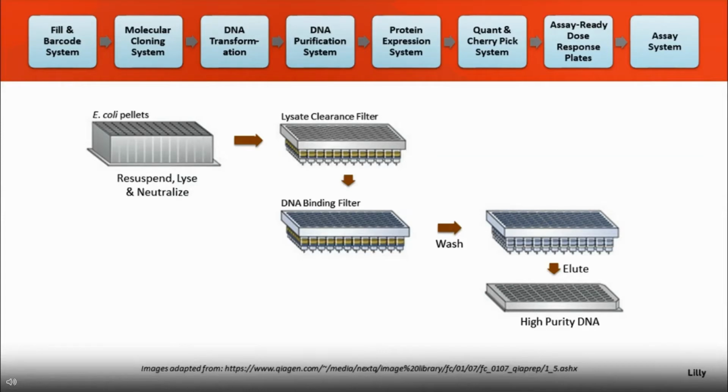If you have other wells that are slow or clogged a bit, then those tend to not get pulled through. Once you have wells around them that get pulled through the vacuum, the ones that are clogged or running slower tend to be more and more difficult to pull through the filter plates.